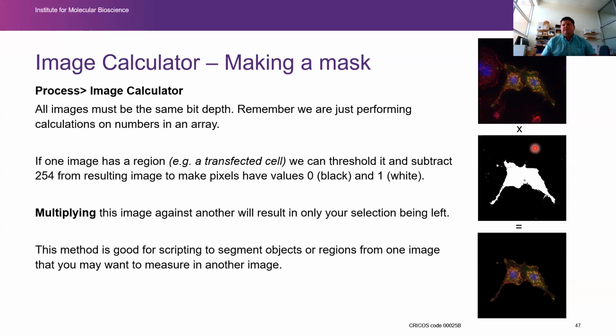Where this can be useful is, you may have noticed when you perform background subtraction, it takes 1 or 2 seconds, whereas most other things in Fiji are almost instant. If you're doing this on 10,000 images, that step takes a long time overall. And so this is one way where you can quickly do a sort of background subtraction or removal to do other steps where it's faster.